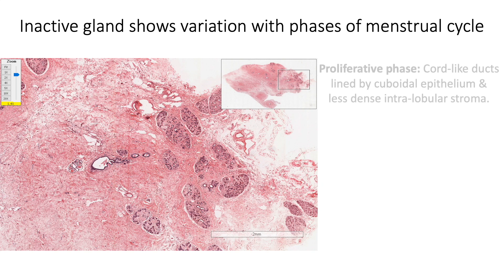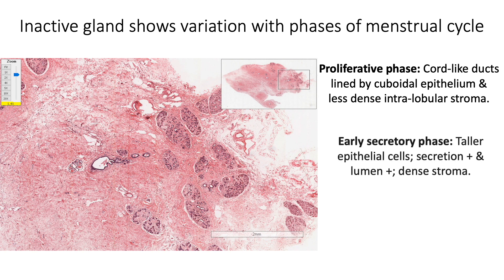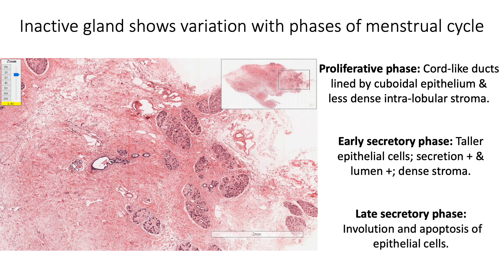In the proliferative phase, the cord-like ducts are lined by cuboidal epithelium, show no lumen, and the stroma is less dense. In the early secretory phase, the epithelial cells become taller and show a small amount of secretion; there is presence of lumen in the ducts and stroma becomes dense. In the late secretory phase, the epithelial cells undergo involution and apoptosis.